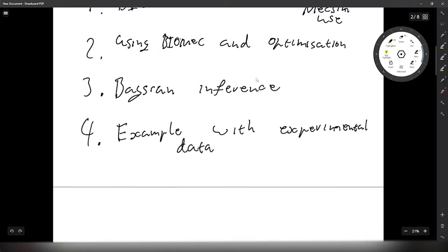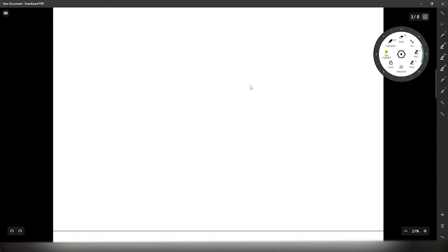Now, if you're watching this, I assume you either have a basic understanding of voltammetry or electrochemical processes. BIOMEC is, and what MECSim is, basically a simulator for simulating dynamic voltammetry experiments, fundamentally designed for Fourier transform AC voltammetry.